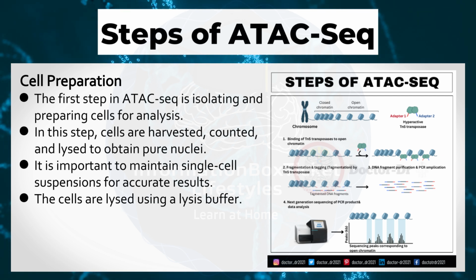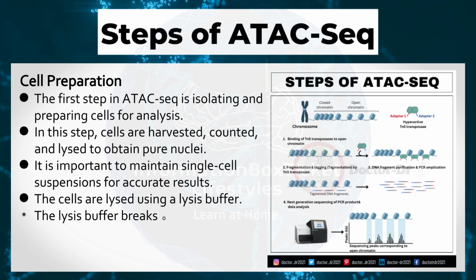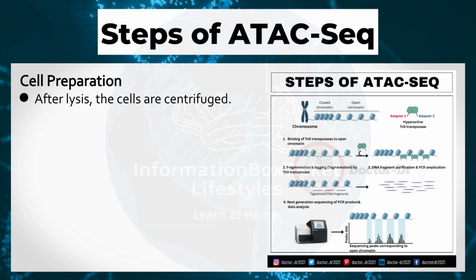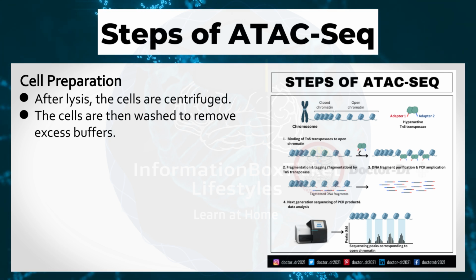The cells are lysed using a lysis buffer. The lysis buffer breaks open the cells and releases their nuclei while keeping chromatin intact. After lysis, the cells are centrifuged. The cells are then washed to remove excess buffers.